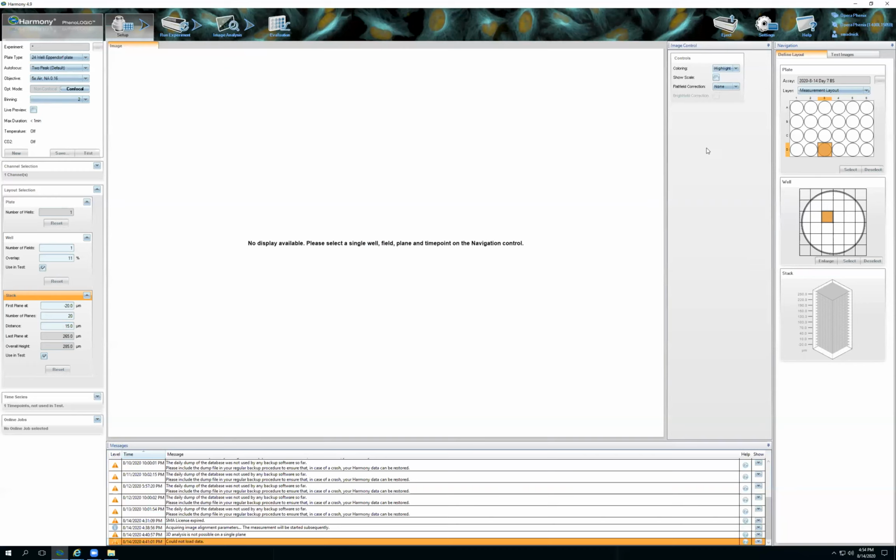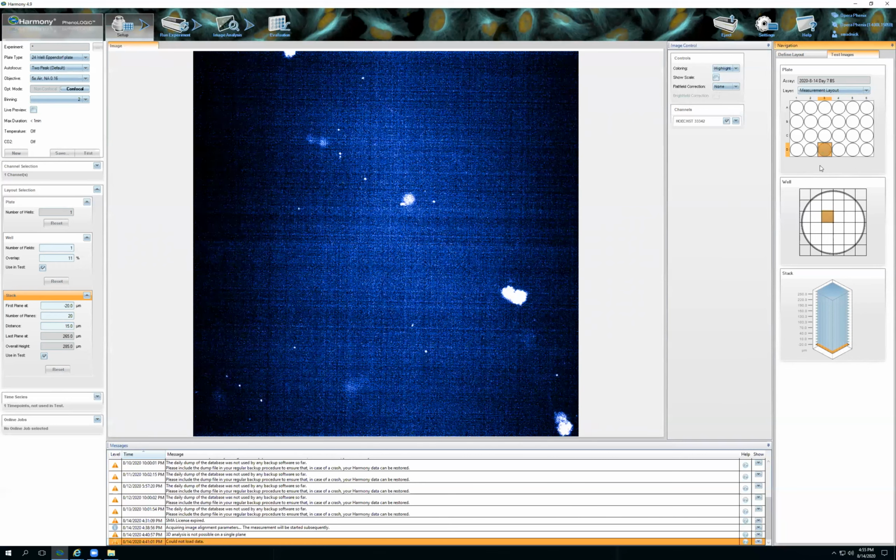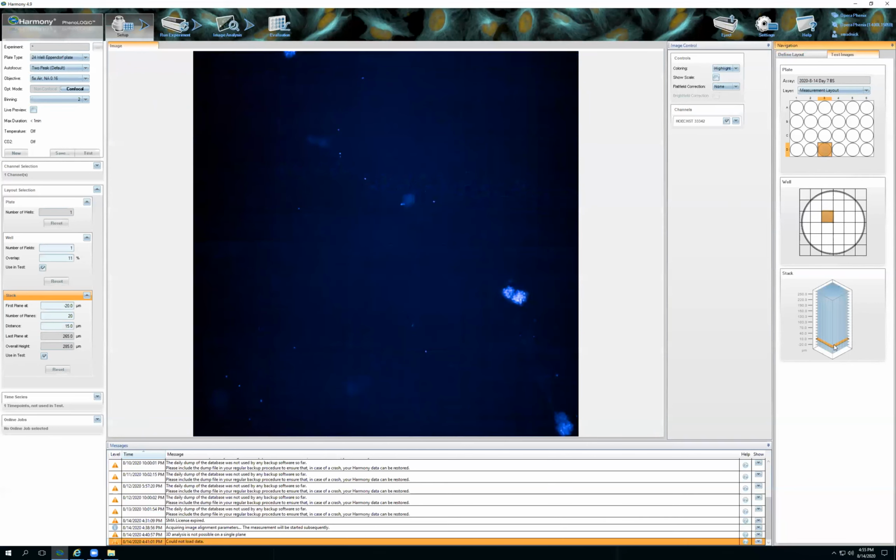So every time you hit test or anything to run, you have to go to test images, this other tab, and when it turns blue, that means that it's done. So you need to select this orange, make this orange, and then now you can go through your Z slices and you can see where your spheroids are.